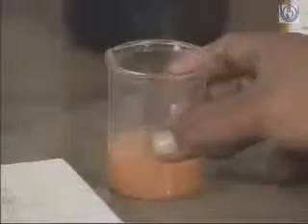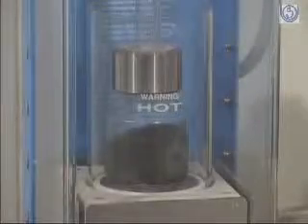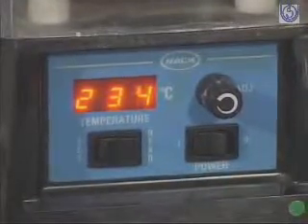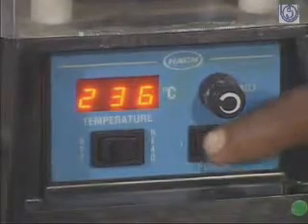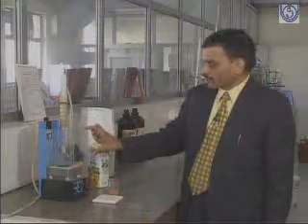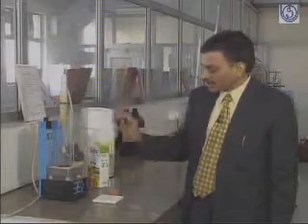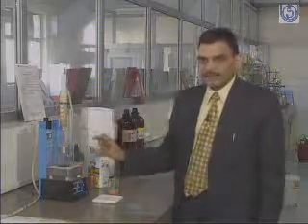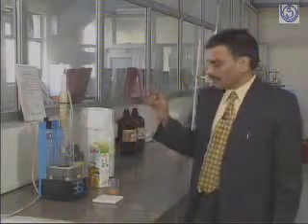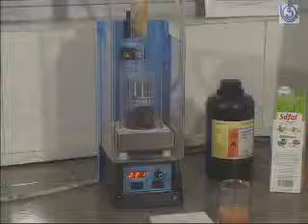For example, this is a juice sample, fruit juice. We have to take it into this flask and digest it. The digestion is taken at a particular temperature, and then it is heated at a particular temperature, and the sample is digested and condensed. Once the sample is digested, it becomes very clear. Once the sample is clear, then you take it for the distillation and titration. In this way, we can estimate the protein in any sample.